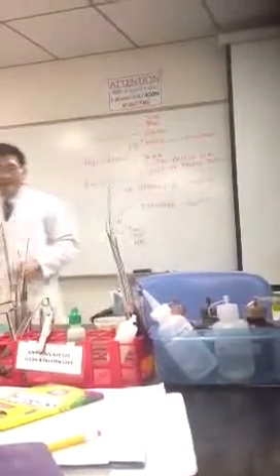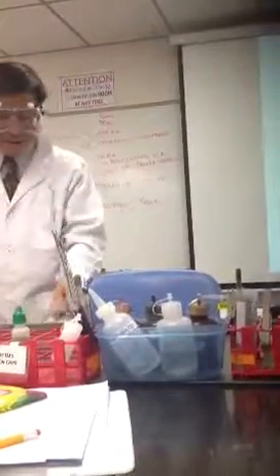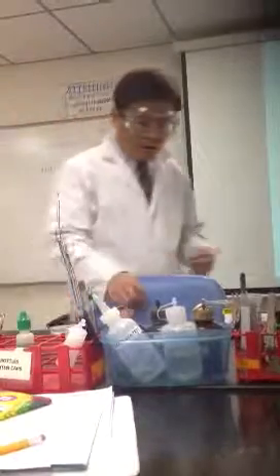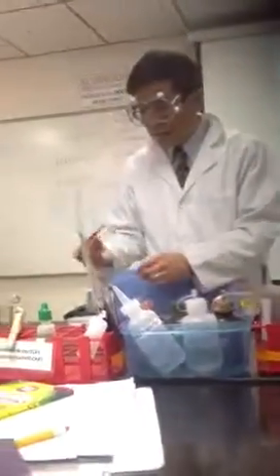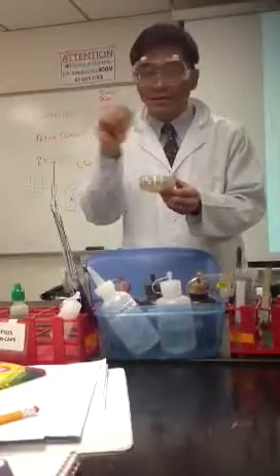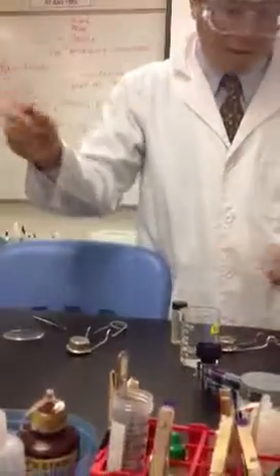This one looks like it's a little more complicated because it's not divided into squares. So the other way you can do this, if you find yourself in that situation, is all you need is a small piece of it. Somehow get a small piece of it, and then stick it on the agar. You have to flame this first.